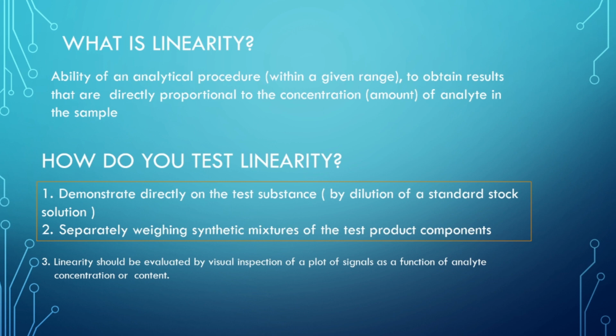The linearity can be evaluated by visual inspection of a plot of signals as a function of analyte concentration or content. So your x-axis will be the concentration, and the y-axis can be anything which is giving a value or response which is directly proportional to the concentration.